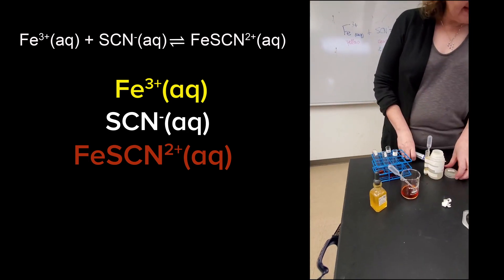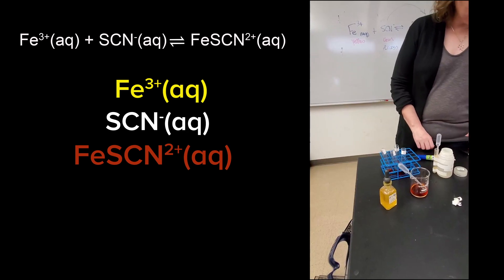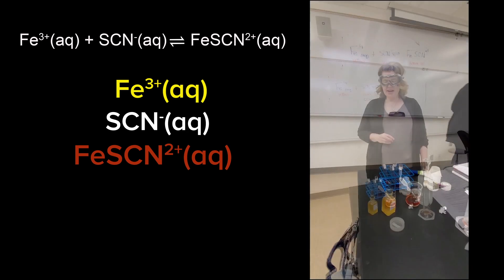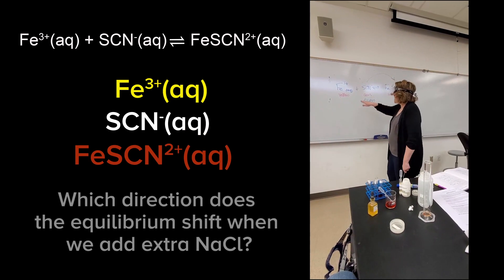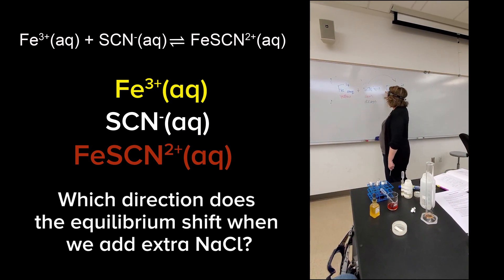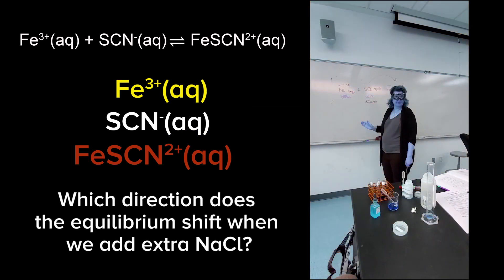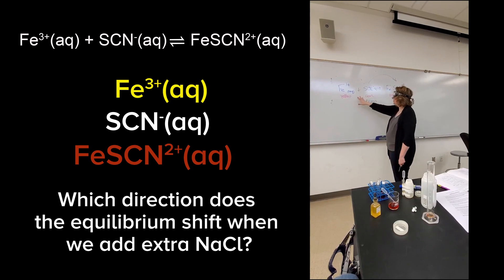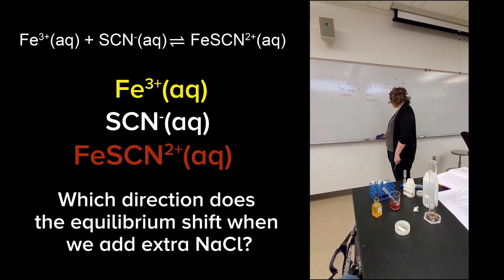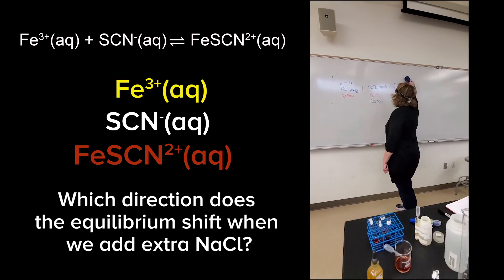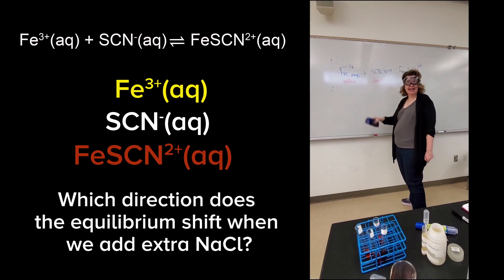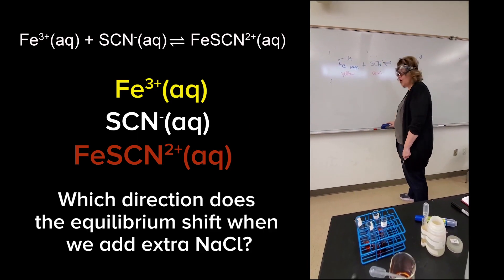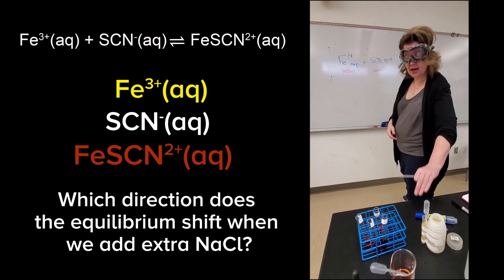Okay. Now finally, the last thing I need to do is add five drops of saturated salt water. So now we're ready to add that sodium chloride. Now, the sodium chloride is not common to this system. So I can't just look at where's the excess in a shift. It's a little bit different. The other way that we can shift an equilibrium besides adding a common ion is I can add something that removes an ion.